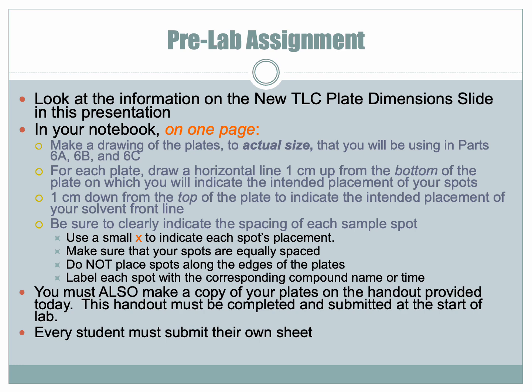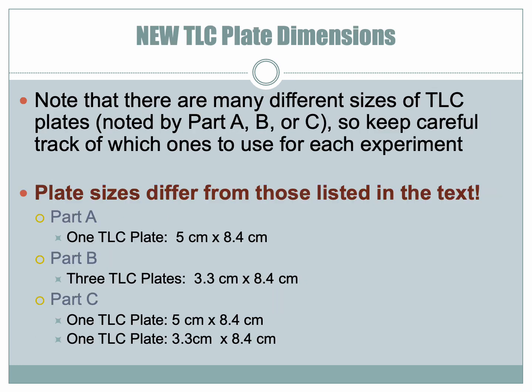So again, we'll go over all of this at the beginning of lab on Tuesday, the specifics here, but make sure you read through the technique in your book so that you understand before you get to lab, you have some familiarity with what we're going to be doing. The plate dimensions listed in the book, we've changed those as well, and so here are the plate dimensions that we're actually going to be using. So when you need that information, please refer to this page.